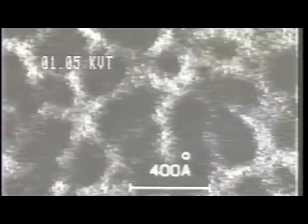So what we're doing now is raising the field strength by raising the voltage, ramping it linearly in this case, because we know that all of the species that come off the surface are ones that correspond to those from the ice layer. What you'll see happen is as we peel away this layer, you'll see dark areas developing, and then we're going to integrate, like you would on a photographic film, and we get a series of contours. Those dark areas correspond to clusters of molecules sitting on the surface.